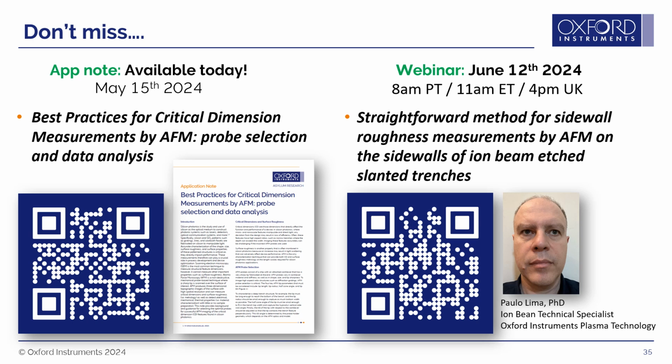Okay. And also, can AR Maps be used with the MFP-3D Origin data? Yeah, so as I mentioned, AR Maps is a new software package for Asylum. Right now, we are including it standard with Jupiter systems moving forward. That said, it's compatible with images from both our Igor AFM software and our Ergo AFM software. So it'll analyze any of our AFM images from either of those software packages. That includes the MFP-3D, our Cypher, Jupiter, and also our new Vero AFM. Okay, great. Because that was actually one of the other questions, whether you could use Igor files or Ergo. So the answer is yes, both can be used.